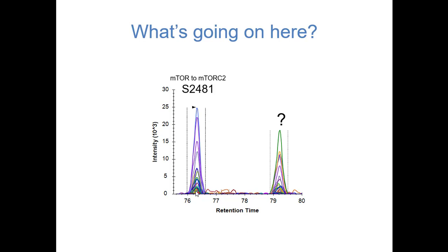That's exactly right. So the idea here is it's the same peptide. It's got the same number of phospho sites on it, basically. It's been phosphorylated once in this case. But this one is phosphorylated at the canonical known site. And this is the same peptide, just phosphorylated at a slightly different site. That's going to change some of the fragment ions. It's going to change when it elutes, but the precursor mass is going to be exactly the same.